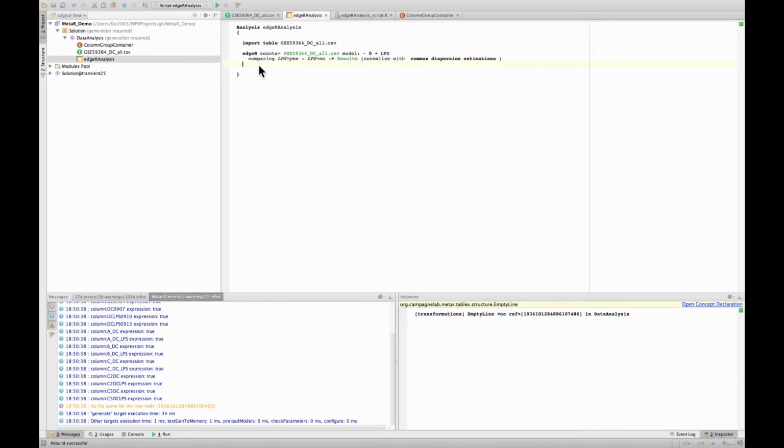So we have the results. Now one thing that we would like to do is to build a heat map. In order to do this, we should focus on the top genes. So we will start to subset the table.